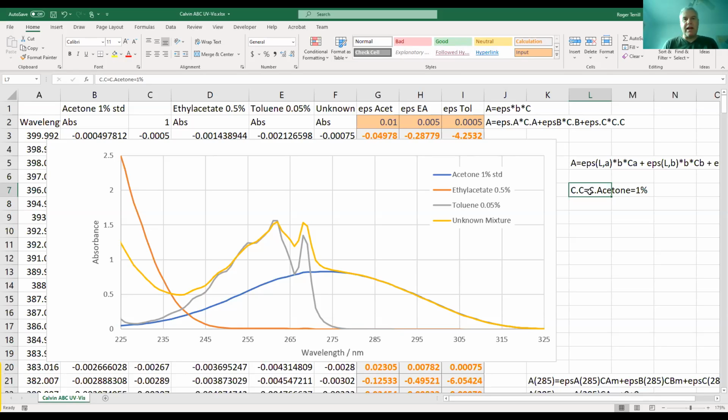Possibly. Sure, absolutely. So now if you look at a long wavelength where the bourbon has no absorption, can you tell me the bourbon concentration? If instead of your eyes seeing the entire spectrum, you can only see at a wavelength where the bourbon has no absorbance, can you tell me the concentration of bourbon without tasting it? I don't think so. Exactly right.